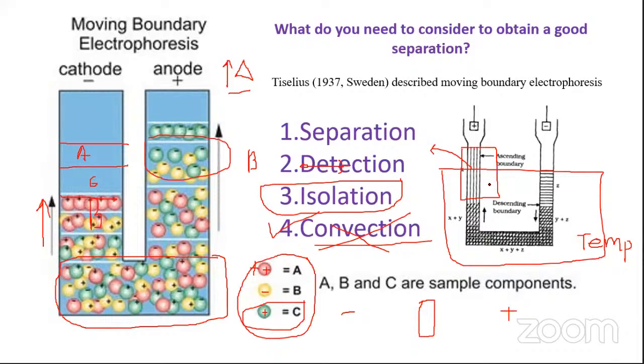It is heavily concentrated with X. So as soon as I turn off the current that was pulling X towards this positively charged electrode, X will start to move down, correct? Are you getting the point? So ultimately, even if you can get separation here, you cannot isolate. You cannot get an isolated band, or an isolated solute, in such a situation.